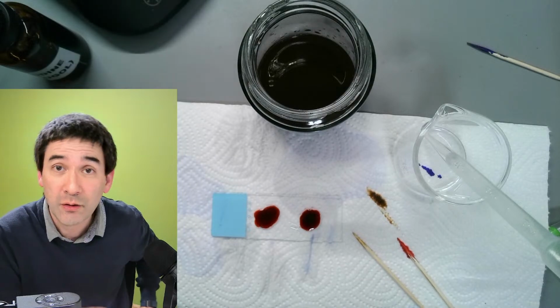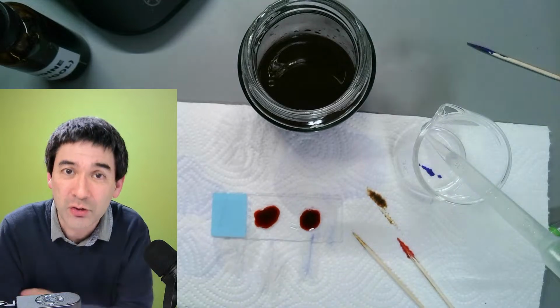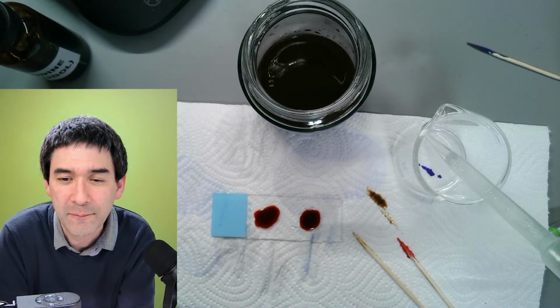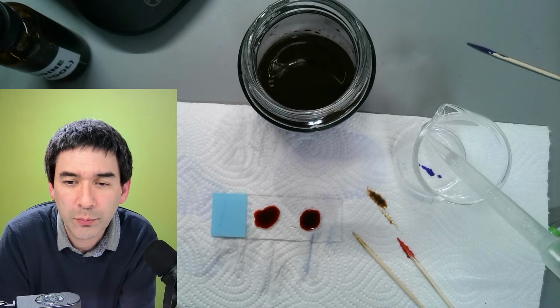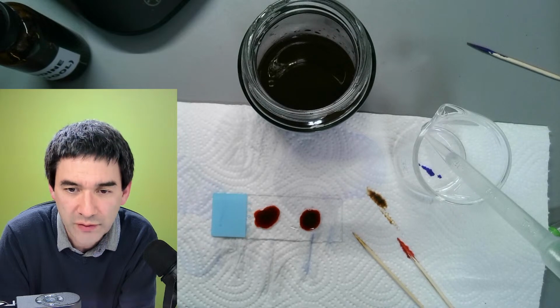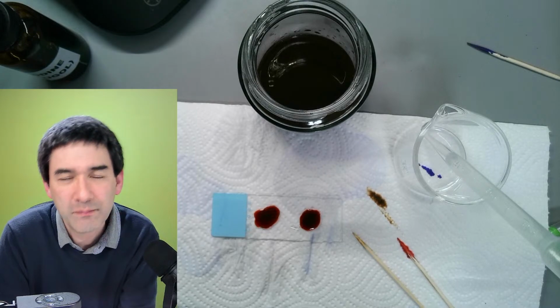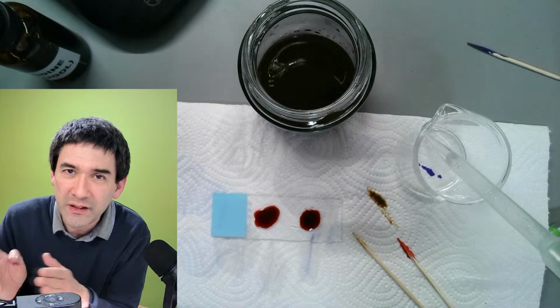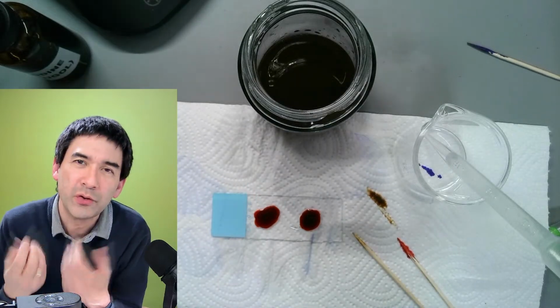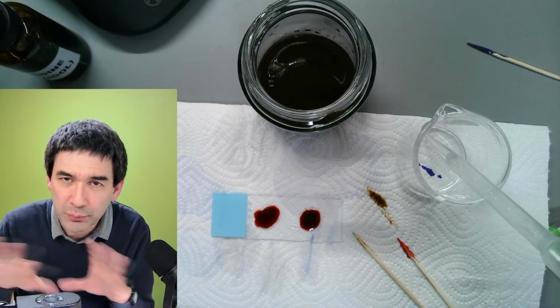Okay, and then you've got E. coli and yogurt bacteria, so a Gram positive and a Gram negative bacterium, and you can nicely compare them side by side. A mixed bacterial group will show red and blue bacteria. That's correct. You can only say one of them is Gram positive and the other is Gram negative. It won't allow you to specify in detail which one it is, but at least you can separate out the groups.